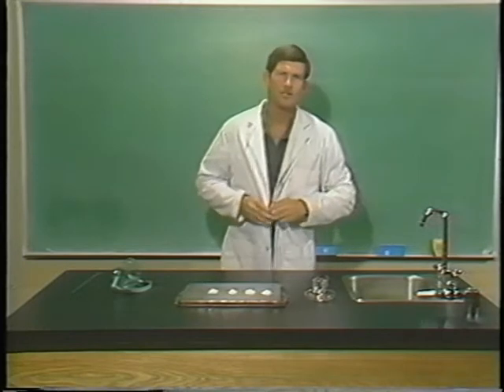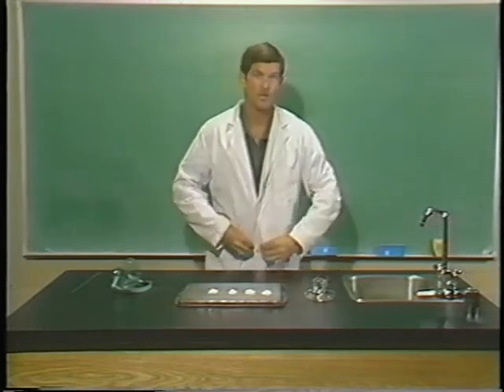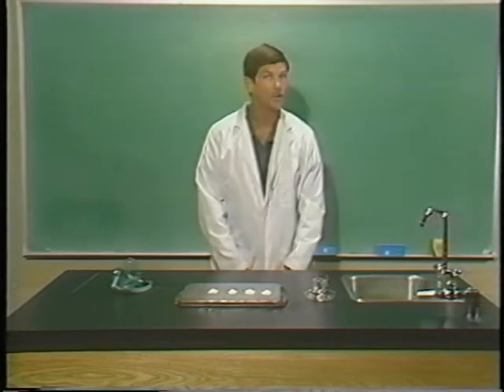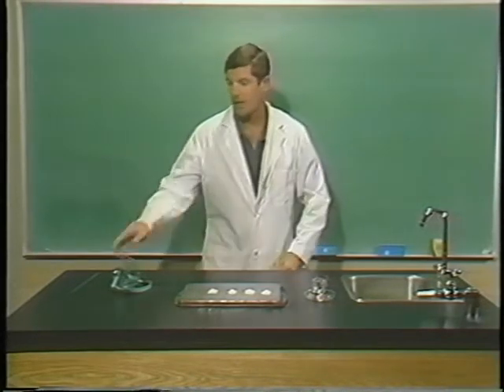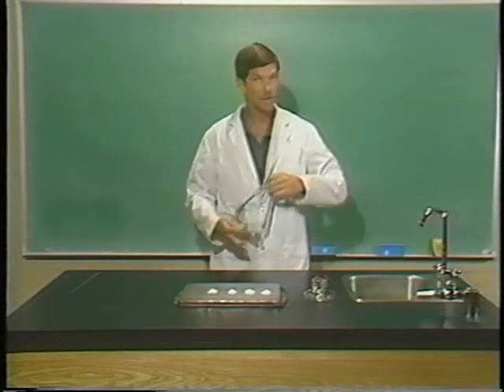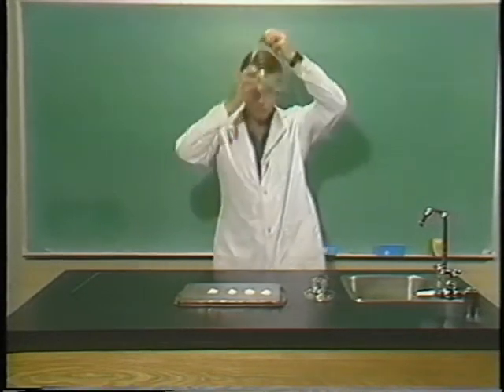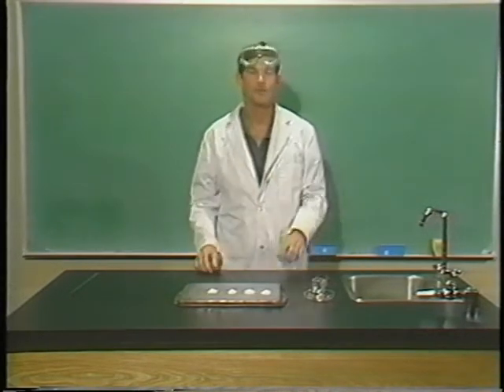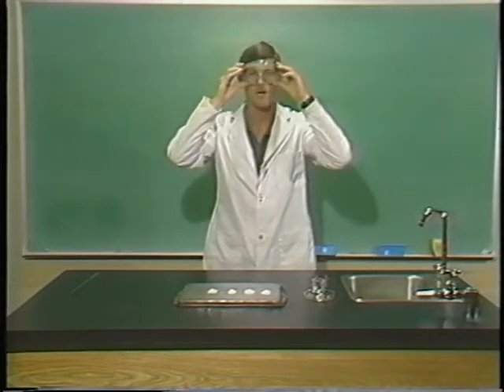Now, another important thing to do is to have safety goggles. When you do science experiments, particularly ones that are boiling or splattering, or you're not sure what's going to happen, you should have a good pair of safety goggles to wear. And safety goggles are not, as a lot of students think, forehead protectors. They're not to be worn up here unless you're away from your experiment. They're to protect your eyes.